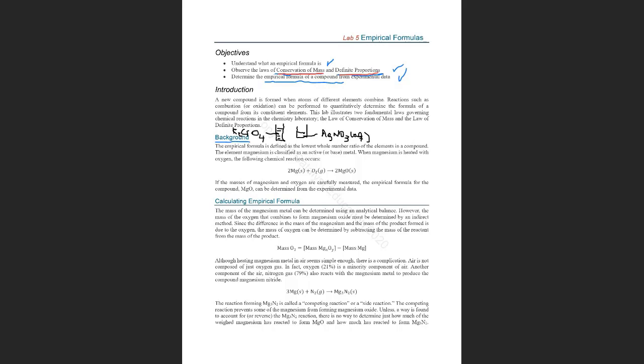So we have two liquids, and we are going to take the weight of those liquids. We are going to place them on a balance and measure the mass of the graduated cylinder, of this beaker, and the potassium chromate and the silver nitrate.